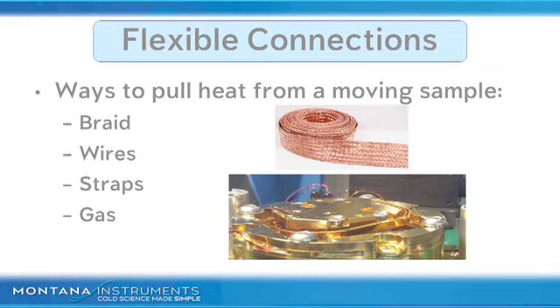Braids are usually pure copper, which is always oxidizing. The more you handle it with your fingers, the more it will oxidize over time. If you look through a microscope at a small wire that makes up a braid, you will notice its surface is not smooth. In fact, it looks more like Velcro than a smooth surface. That's important when you're talking about vibration isolation. It's important that you have a very flexible material. If every one of those wires has a surface like Velcro and the oxide grows over time, then you'll have an interface at the surface that actually adds to the stiffness. Although this technique is commonly used, it may not work as well as you want for a high-performance application, and you may see degraded performance over time until it needs to be replaced.